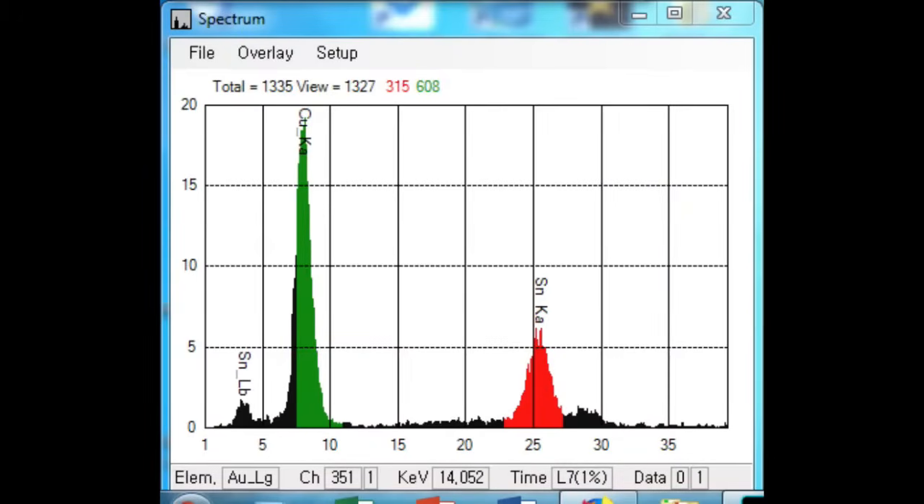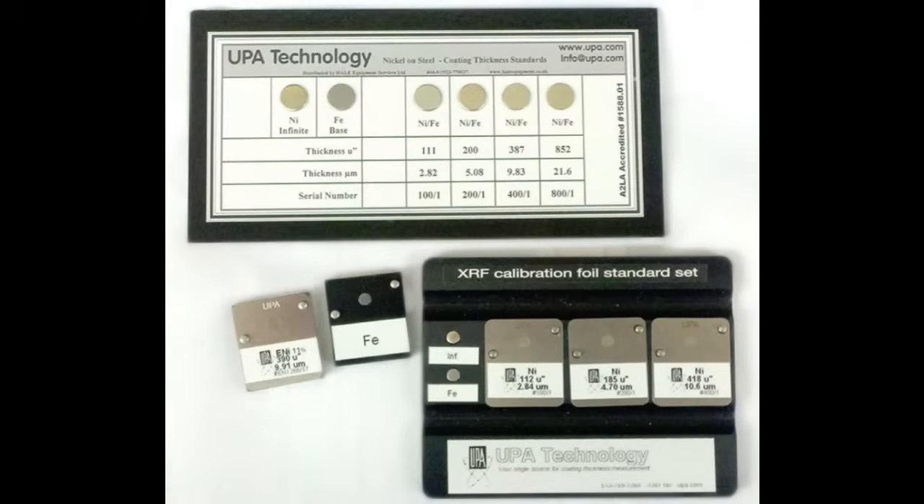The system reliability, diagnostic software, and UPA technical support eliminates the need for expensive service contracts. UPA Technology offers a complete line of X-Ray thickness standards for all brands and can also recertify existing standards.